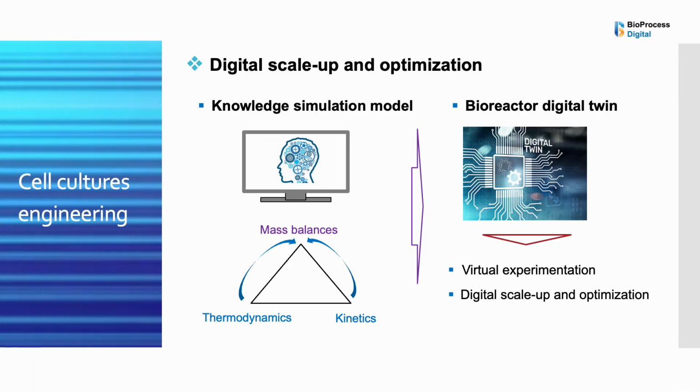To accelerate process development and scale-up, bioprocess engineering increasingly relies on knowledge-driven simulation models built on a deep understanding of key physicochemical and biological phenomena. These models act as digital twins, virtual representations of bioreactors, enabling in silico experimentation across a wide range of operating conditions. Typically developed using laboratory-scale experimental data, these models play a crucial role in optimizing operating modes and process parameters, ultimately supporting goals such as maximizing productivity or minimizing production costs.